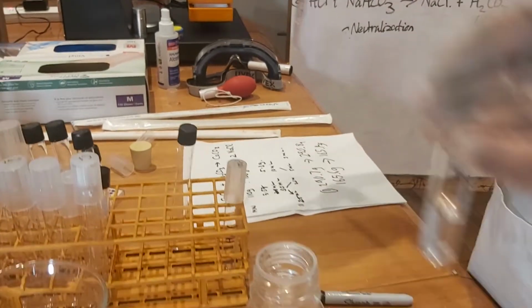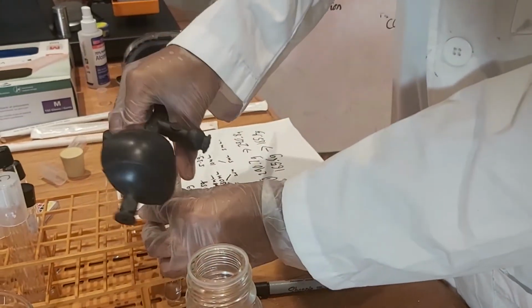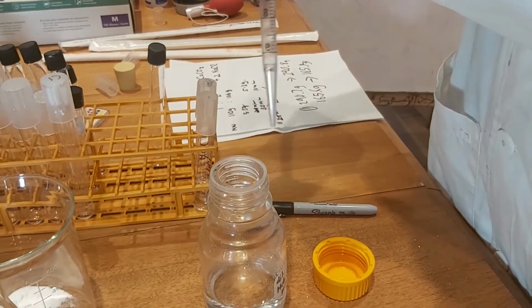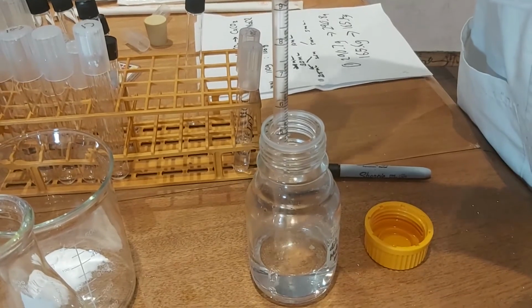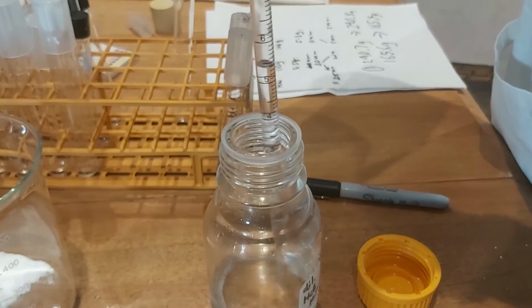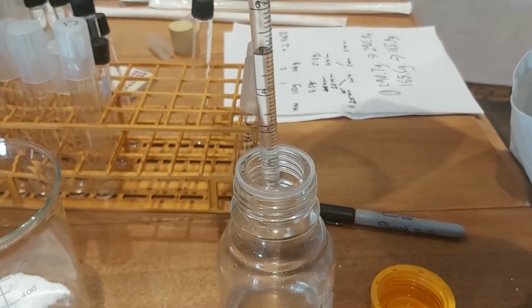Right, now we're going to cap this very tightly. Second time. Another 5 milliliters. A little too much. Another test tube.